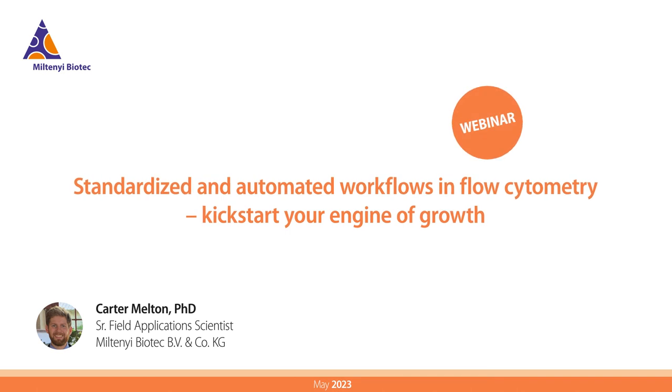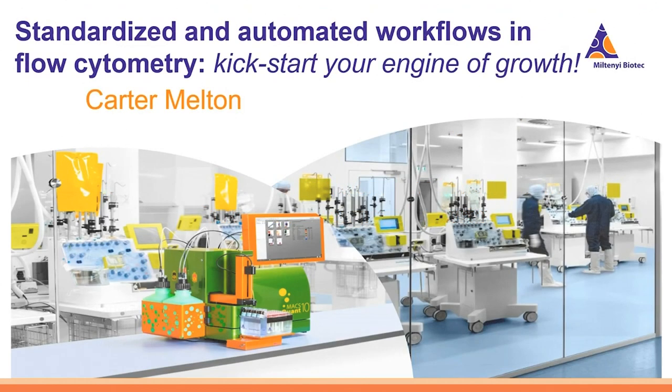Hello everyone, my name is Carter Melton, and today we will be discussing the process of standardizing your flow cytometry workflow. These principles will apply to various flow cytometry platforms, but I like to break the process down from the ground up and review all the steps required to grow and automate your flow cytometry workflow while achieving reproducible results.